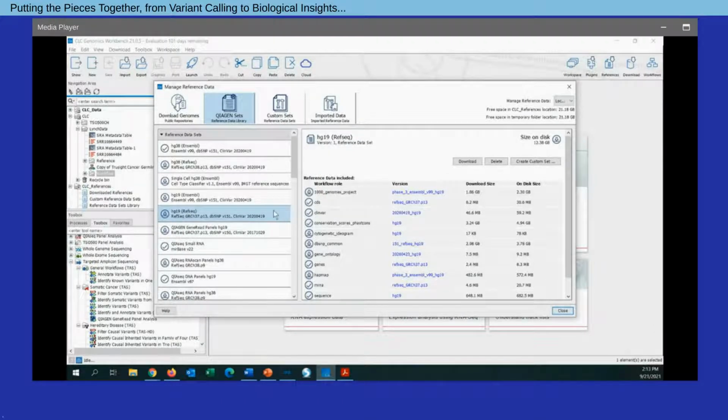And for today's example in particular, I'm going to utilize this HG19 RefSeq set for references. Now, through a singular download here, what I will capture is the genome sequence itself. In addition to that, information with regards to the transcriptome in the context of RefSeq. And then, as you can see here, other third-party database information: dbSNP information, ClinVar information, and information from 1000 Genomes as well. So by simply clicking this download button, I will generate all the necessary reference information that I need to run my analysis.